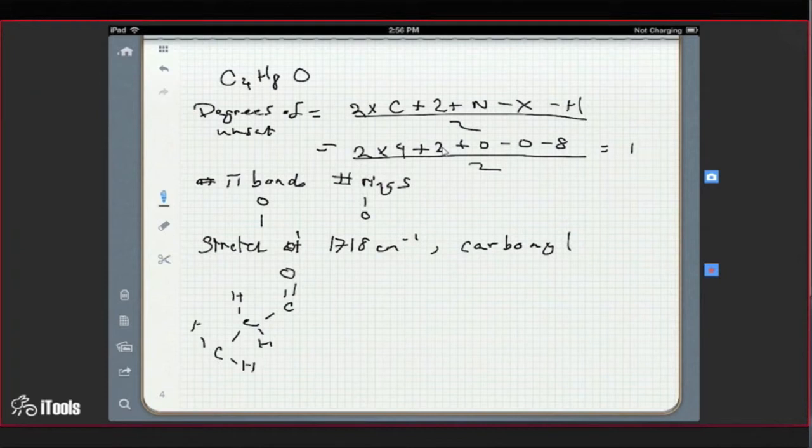And that also makes sense with the other peak. There's another CH3 group that's right close to the carbonyl, because it's pulled to the left. It's past 2 ppm, so that methyl group can be here, and then the carbonyl group is even closer, even more pulled. So that has to be adjacent to the carbonyl as well. So I think that's our final answer.